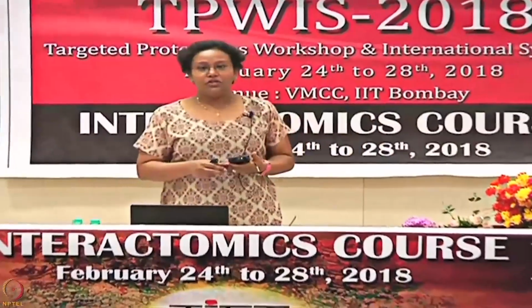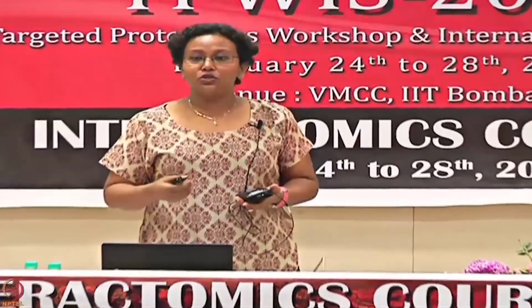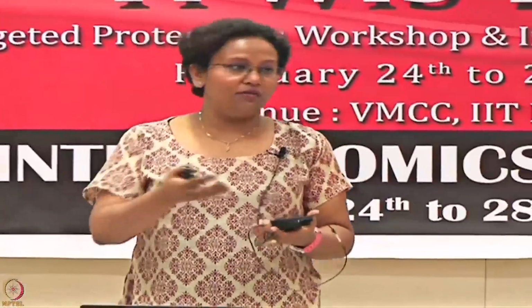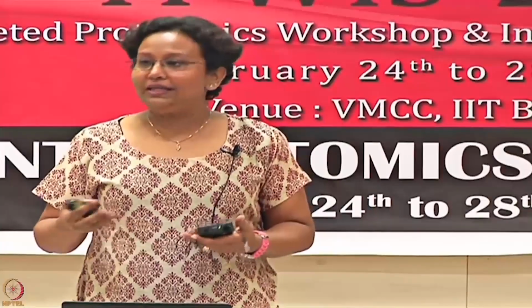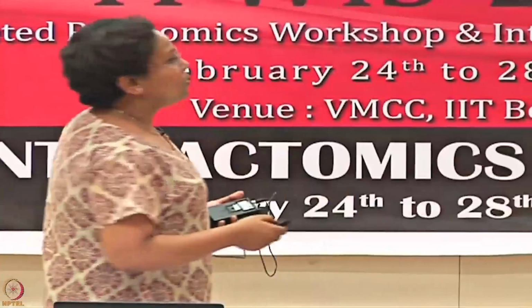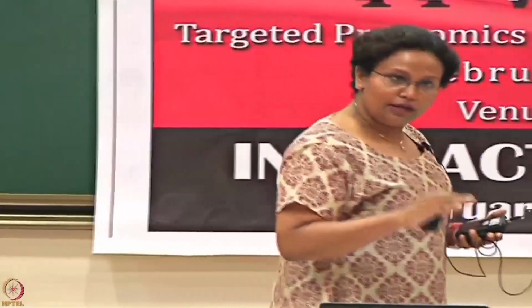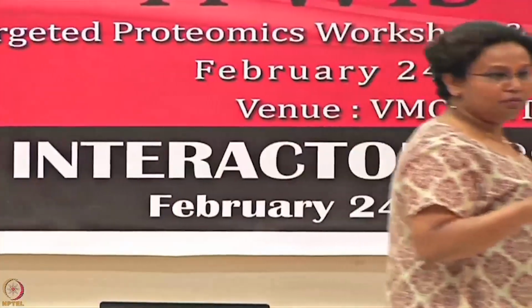The logic here is that when you are already attracting so much at pH 5.5, lowering the pH even further and attracting more doesn't really help for covalent linkage. That's where you start getting steric hindrance, and your covalent linkage is not happening in an ideal scenario. So the key thing is to have your proteins in a comfortable environment, close to where your proteins will be comfortable, and not stress them out in harsher conditions.